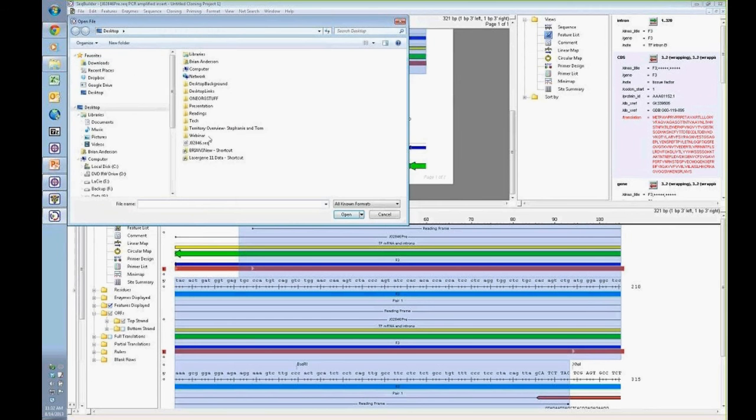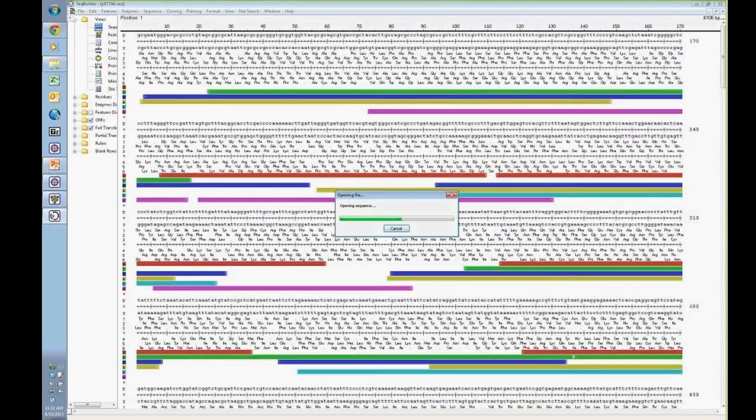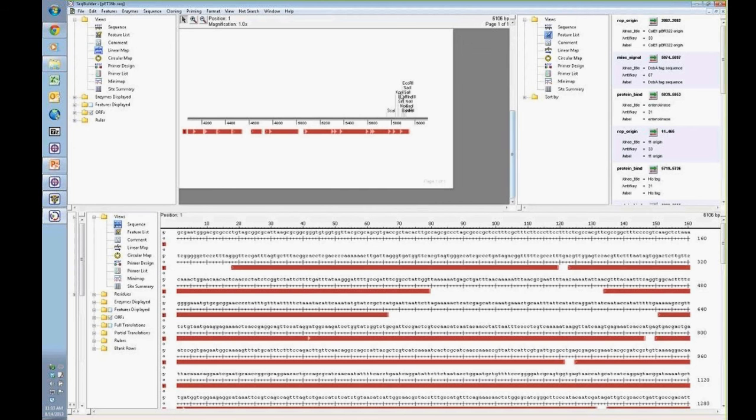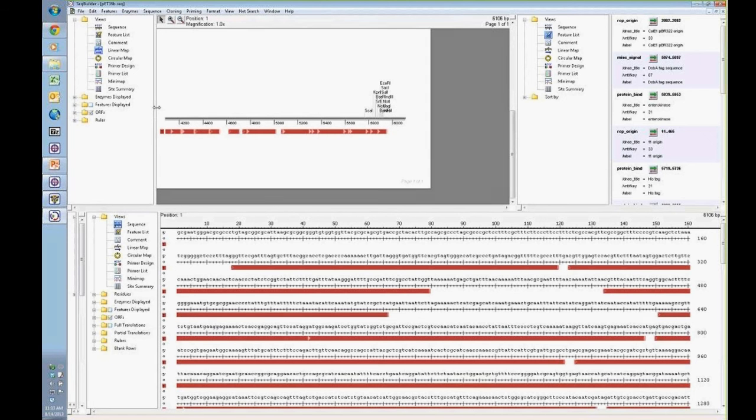And now we want to focus on that pET-39 expression vector. Since this expression vector is coming from a company that sells this as a commercial product, specifically working with the enzymes within the multiple cloning site, the frame is part of their QC process. They make sure that any restriction site they recommend in the multiple cloning site is going to be in frame of that T7 promoter and initiating methionine. If you're working outside the multiple cloning site, it's more important to verify that everything is in frame, whether with a promoter that you're inserting specifically or simply in frame of that promoter that's being used for expression.